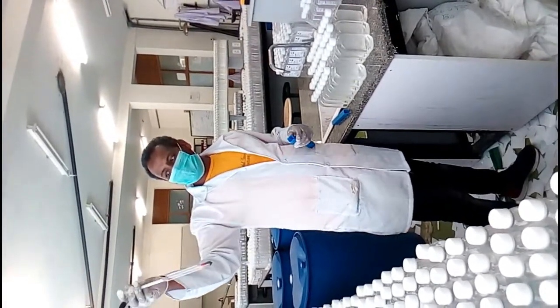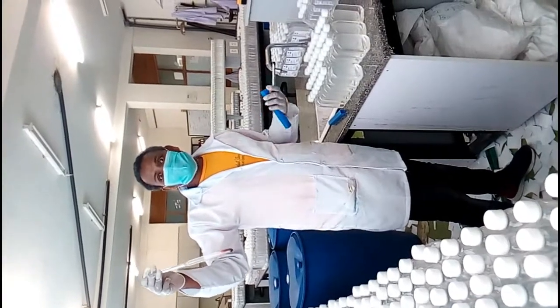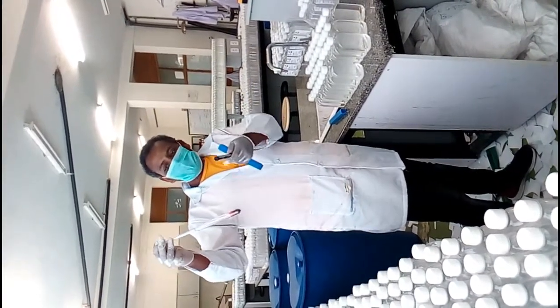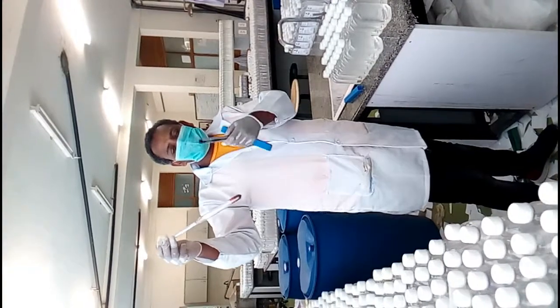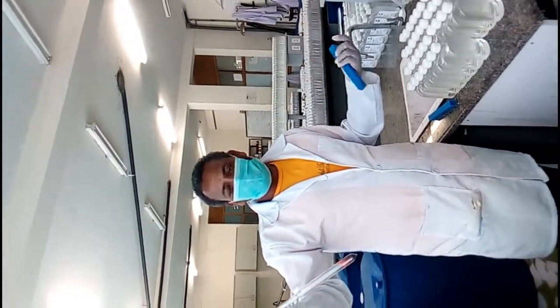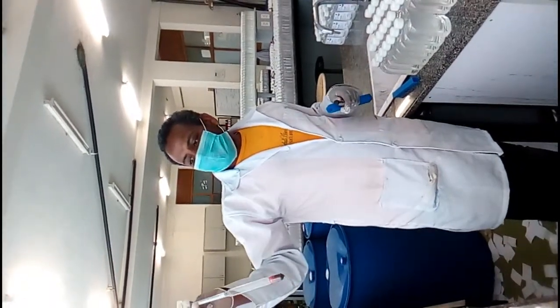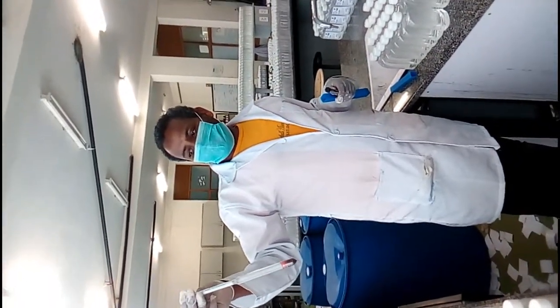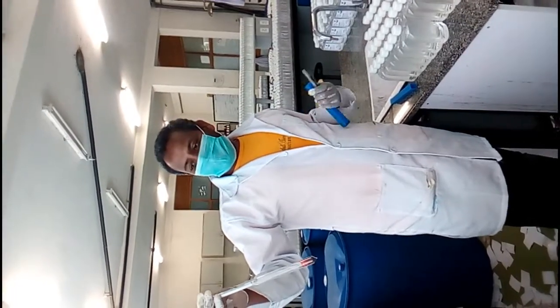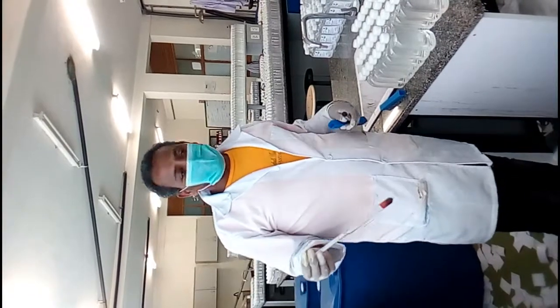This instrument is called alcohometry. You know that "alco" means alcohol, "metry" means measurement. So the alcohometry means the instrument used for measuring the percent of alcohol in a given sample. For example, in our case, our sample is sanitizer, so the presence of alcohol in the given sample can be checked by this alcohometry.